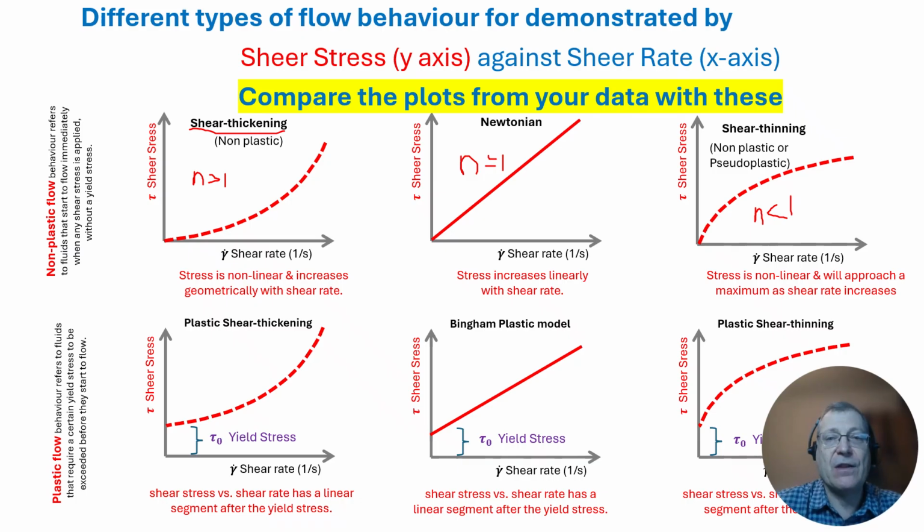The shear thinning behaviour is exactly what we expect from creams and ointments, and it means we've produced a product that resists movement at low shear but then becomes easier to spread the faster you rub it.